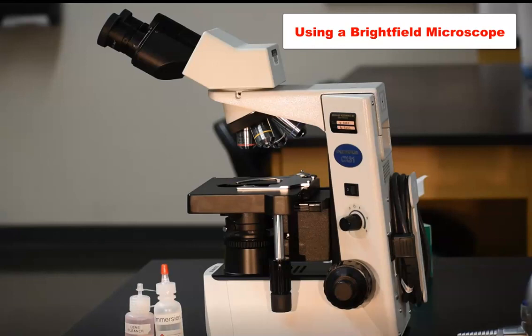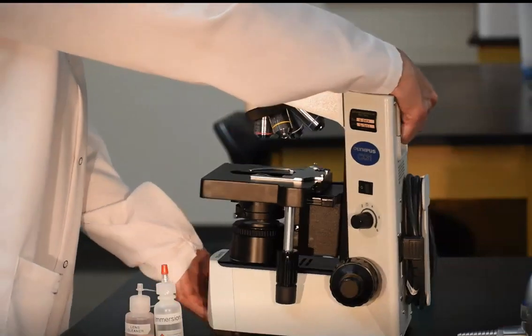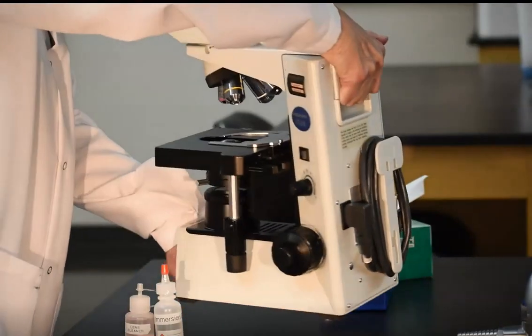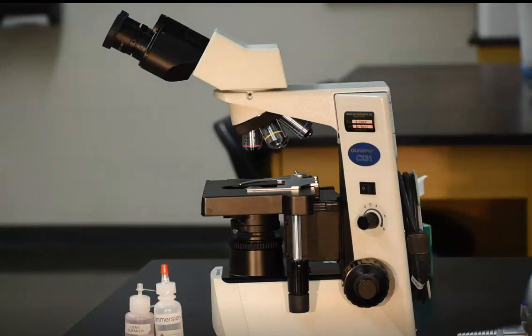This video will review how to properly use a bright field microscope. A microscope is a precision instrument. They can be quite expensive, and knowing how to properly use one is a skill that must be learned and practiced. When moving or otherwise handling your microscope, be sure to use both hands. Hold firmly to the base with one hand, and the other hand will grasp the handle. You do not want to bump or jar the microscope because you risk loosening the lenses, preventing it from focusing.